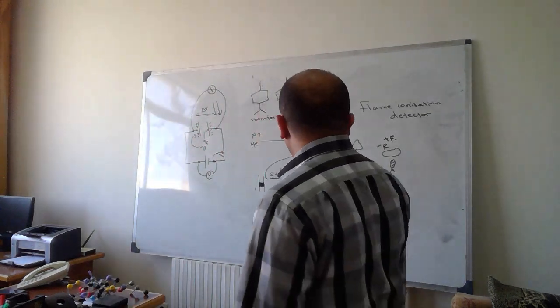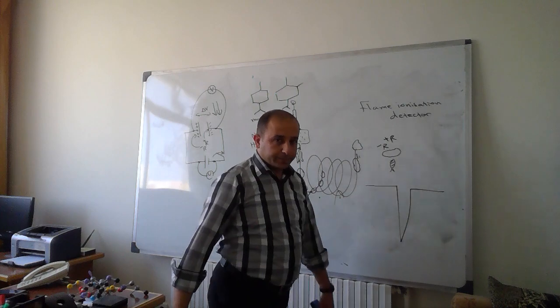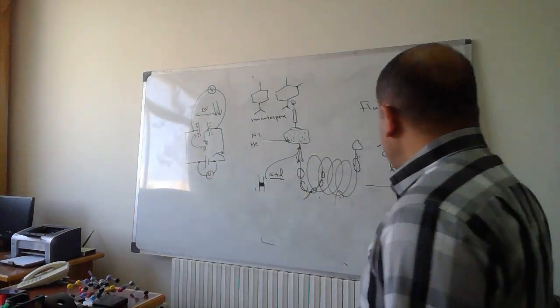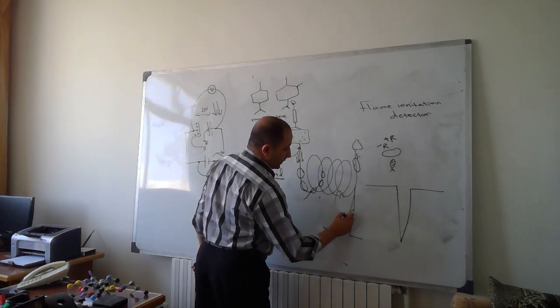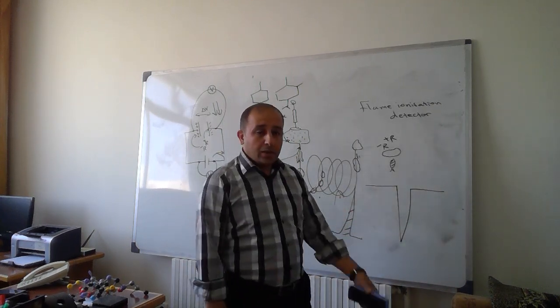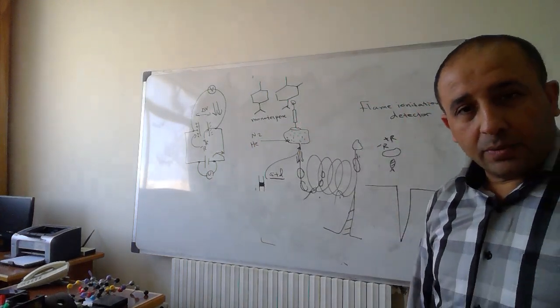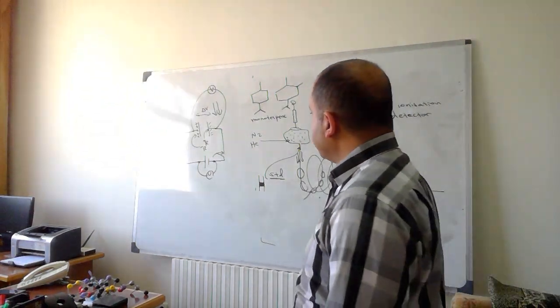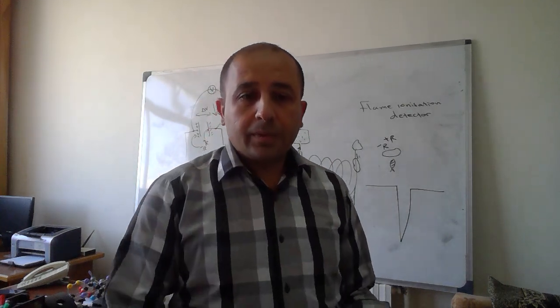So we restore the original voltage, and we will have a signal. If we convert the signal, we will have a positive signal, and with the same idea as TCD, if we compare it with a standard, we can measure the real quantity of material. We will stop now, then we will continue with other detectors.